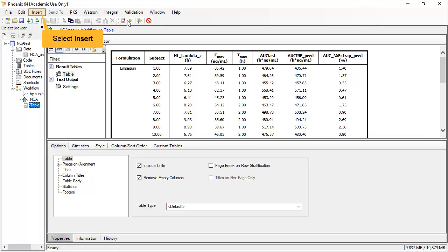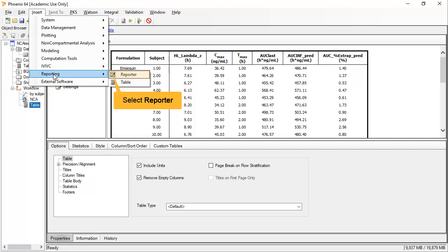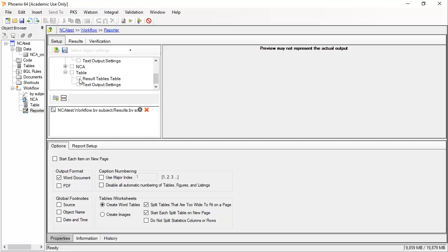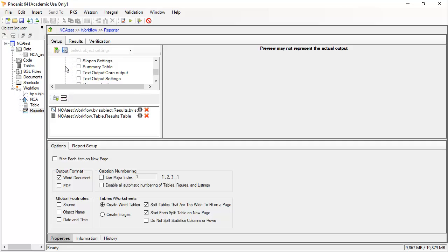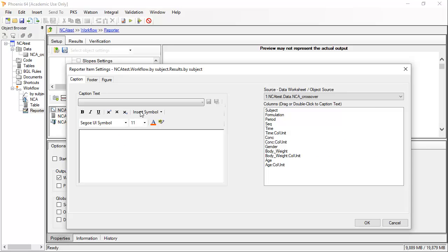With our brief analysis now complete, let me show you how easy it is to create the report within Phoenix. Insert a Reporter object anywhere within the workflow. All source data and workflow outputs within the project can be selected. I will just choose the plots, the final parameter table, and the core output from NCA. As each one is checked, it gets added to the list below, where you can click Settings to further format the output. Captions can contain tags from the data to update automatically — they can simply be dragged over, and other text added around them.